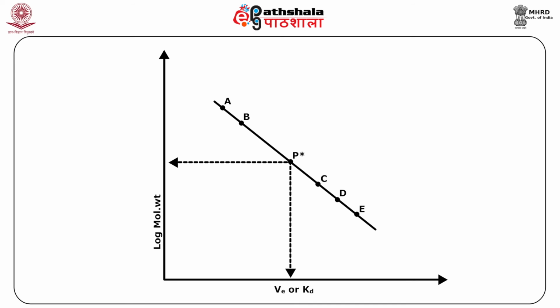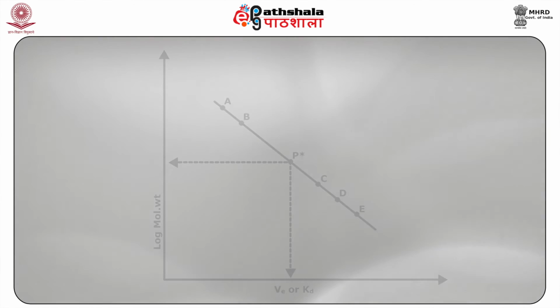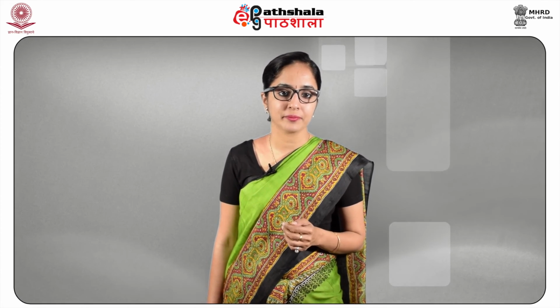Molecular sieve chromatography depends largely on a mixture of molecules being given an opportunity to diffuse into the gel matrix. I would like to reiterate that, students, the greater the number of opportunities for this to occur, the finer the resolution that is achieved in separating the compound into a purer state by this chromatographic technique.